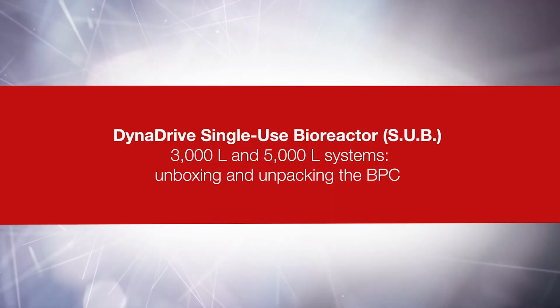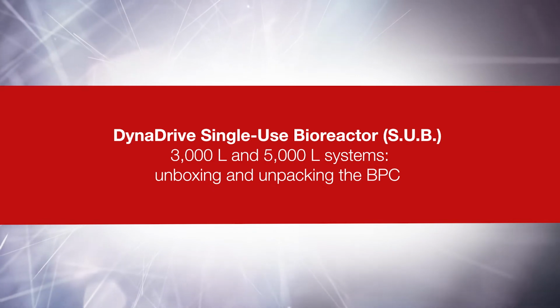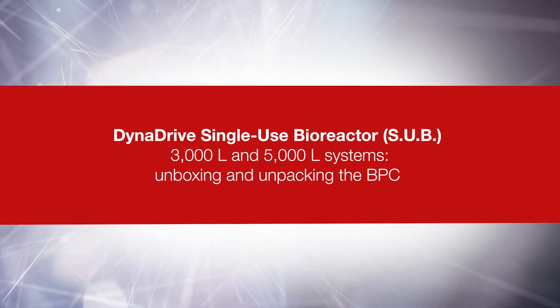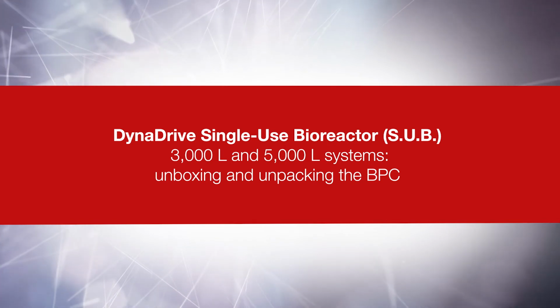This concludes part 1 of 3 videos that cover setup and installation topics for the bioprocess container related to the DynaDrive single-use bioreactor at the 3,000-liter and 5,000-liter scales.